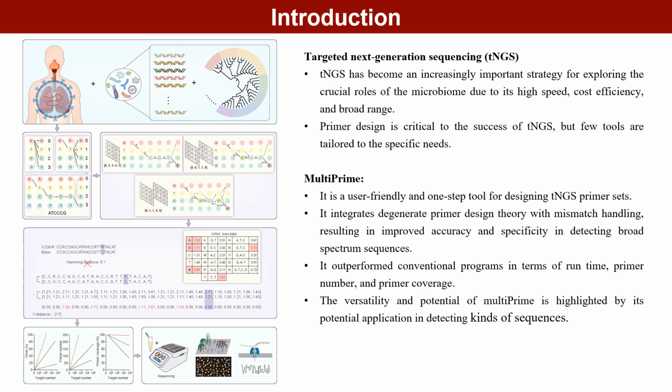Many software programs have been developed to assist in primer design, but few are tailored to TNGS, especially for the challenge of designing primers for large and diverse targets. We introduced multiPrime, a novel tool developed for TNGS primer design.